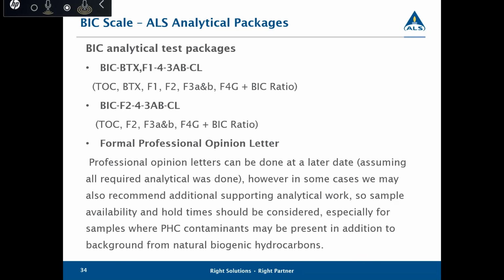So if you don't suspect that there are volatiles in it and you don't feel there is a need to test for F1 and BTEX, that one will test for F2, F3A, and F4G and BIC ratio calculation with the TOC. And we also will provide the formal professional opinion letter if required. There are a few things here for the professional opinion letters. They can be done later on.